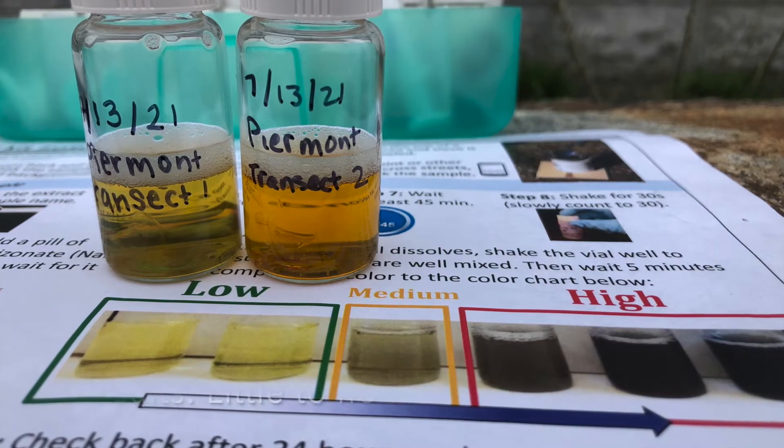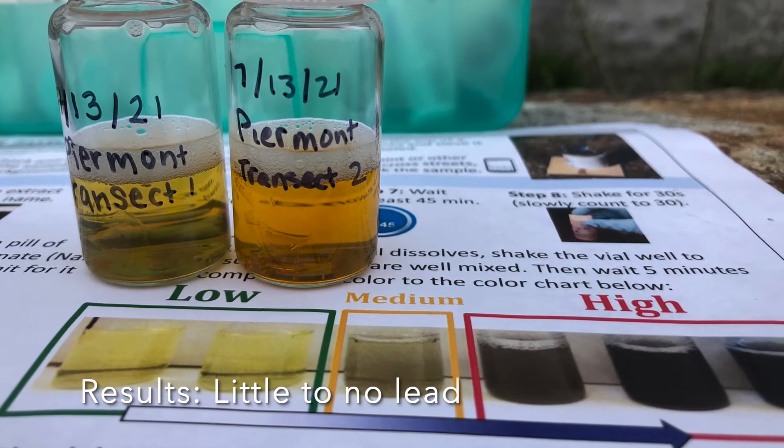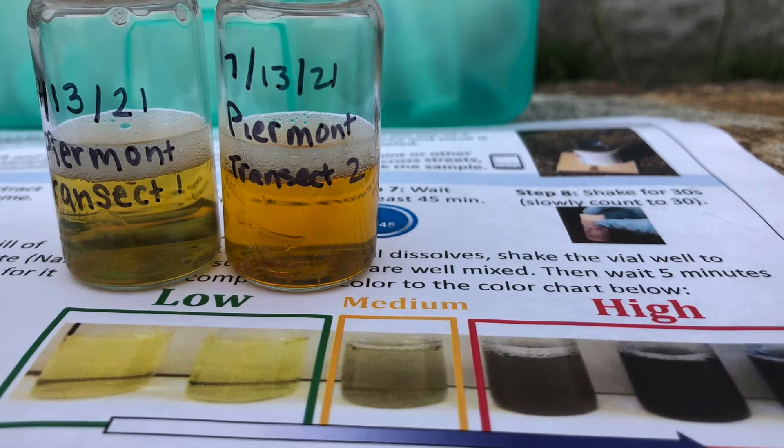A darker liquid indicates a greater lead concentration. Our solution was yellow, which indicates zero to low levels of lead.